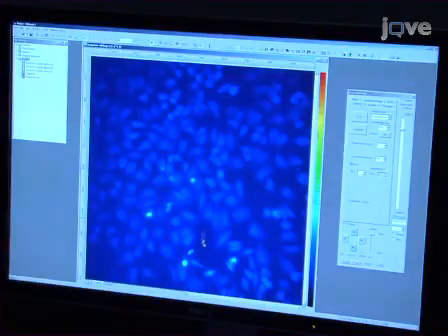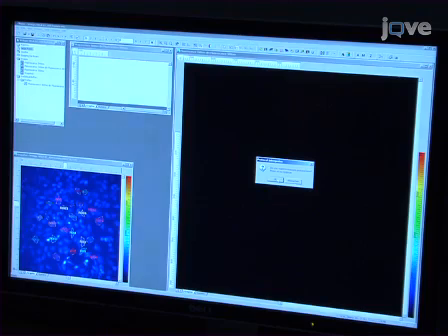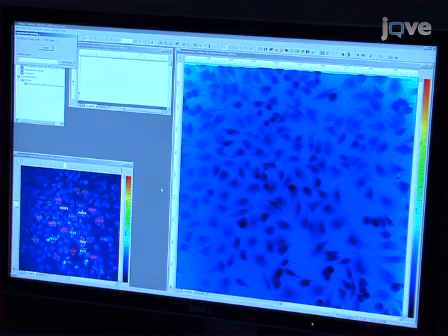Additionally, mark the regions of interest, or ROIs, for a cell-free background region and up to 20 cell contours. Initiate live cell imaging. While the experiment is running, the system will present the ratiometric images for Fura2 signals as well as the real-time F340-F380 ratios for each marked ROI as a line chart, where F340 and F380 correspond to the fluorescence intensity within the ROIs at 340 and 380 nanometers respectively.